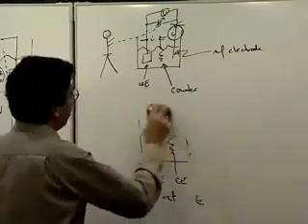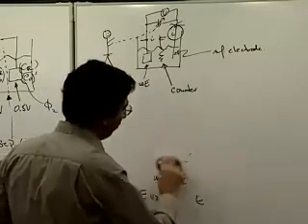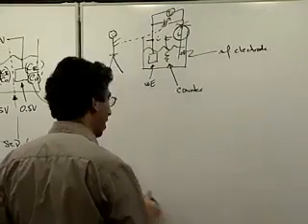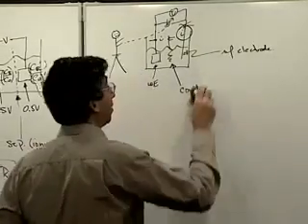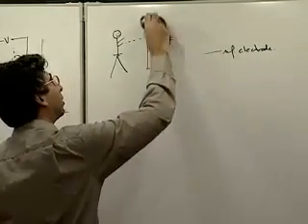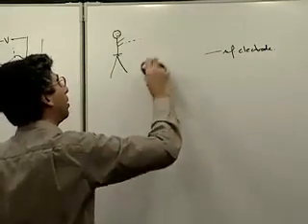But the way we're going to do it, the thing that made electrochemistry possible for the world, for people that weren't dedicated, crazed electrochemists, was the advent of the integrated circuit, and a specific one called an operational amplifier, an op-amp.